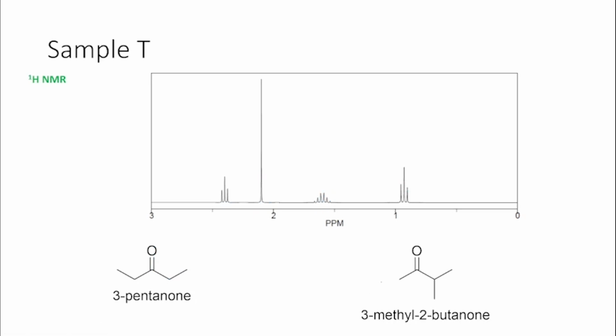If we look at another isomer of pentan-2-one, 3-methyl-2-butanone, again, we would expect to see something different. So we would expect to see this CH3 group sitting somewhere over here. Then this carbon here has only one proton attached, and it's next to two CH3 groups, which are the same. So we would expect this signal here to be a sextet. Oops, that's not right. Oh no, yeah, septet, sorry. I was drawing the right thing, said the wrong thing. So we'd expect this to be a septet.